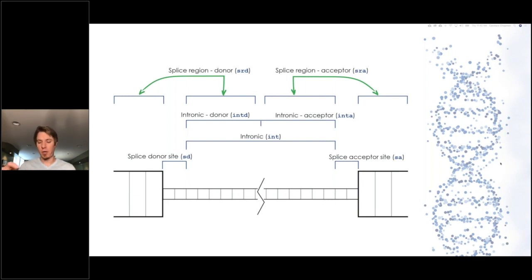We would show you the articles that match those along with any other variants in that same intron as the variant that you searched. That can be very helpful, and sometimes it will lead to the one and only paper that has any evidence on the variant you're searching, in that it shows a similar variant in the same intron.